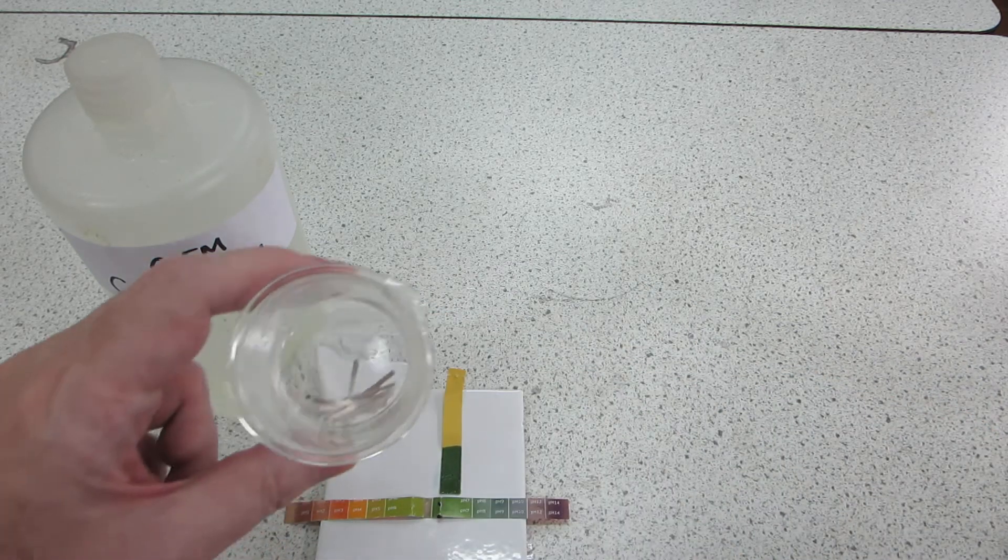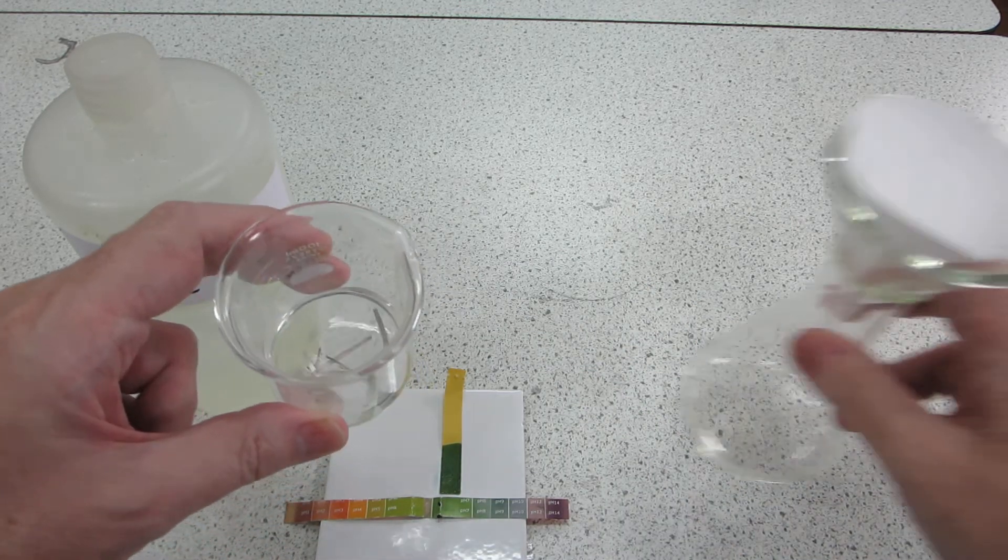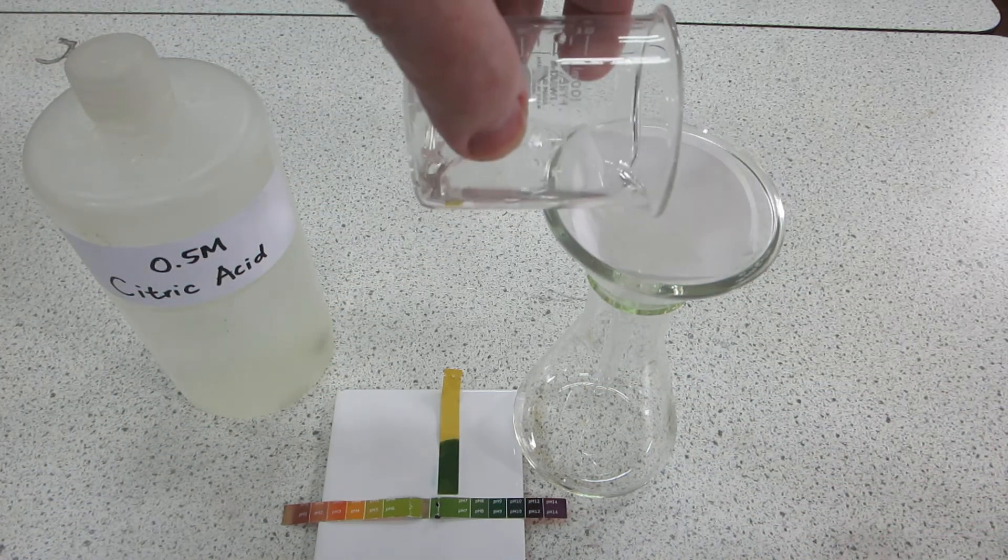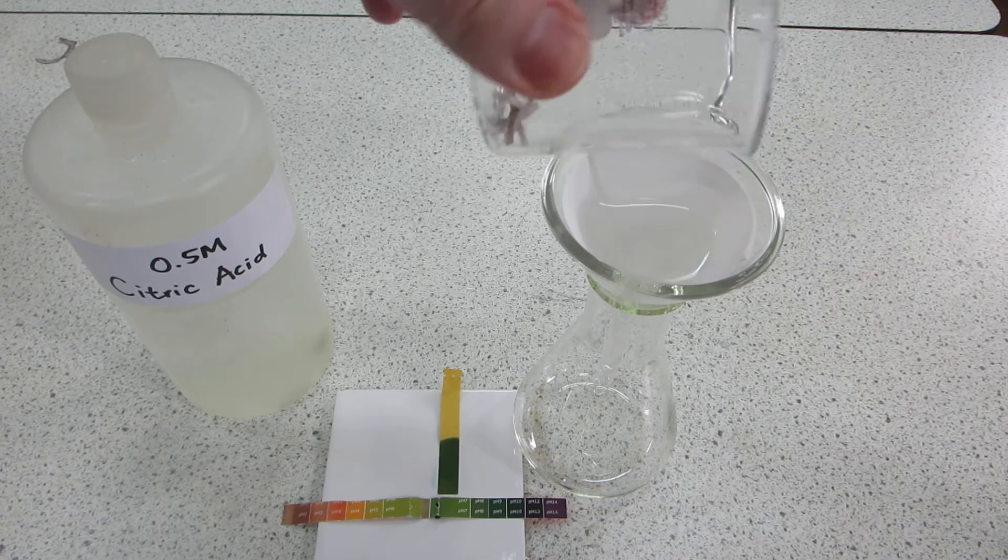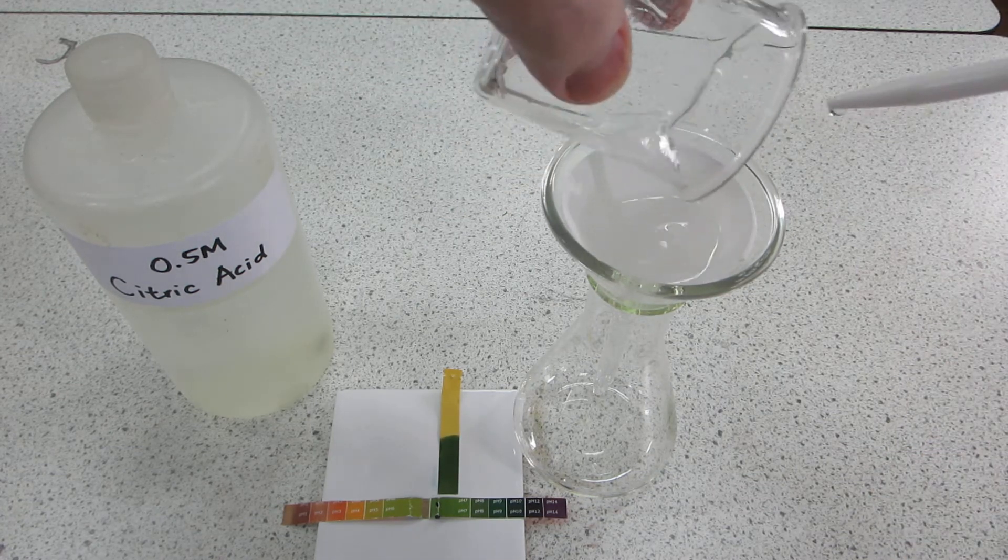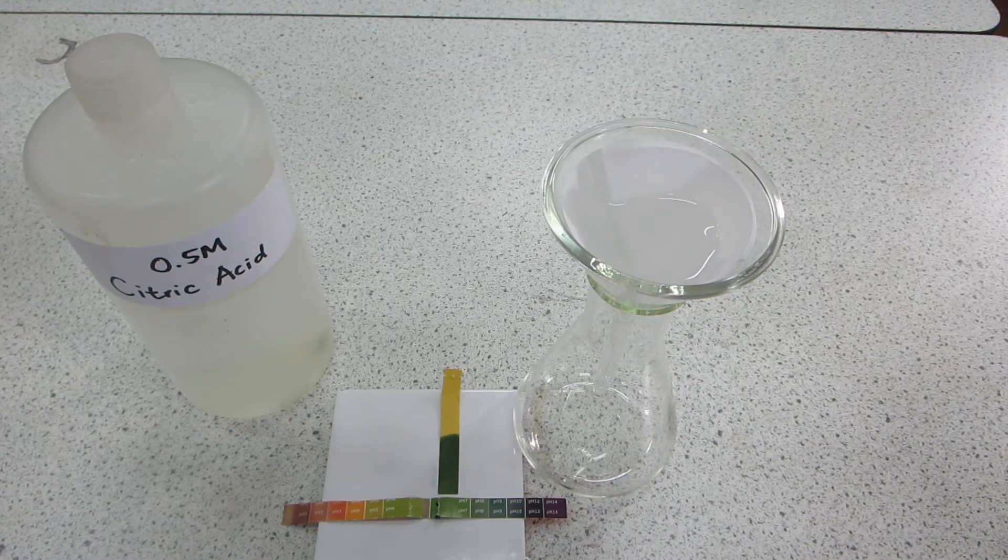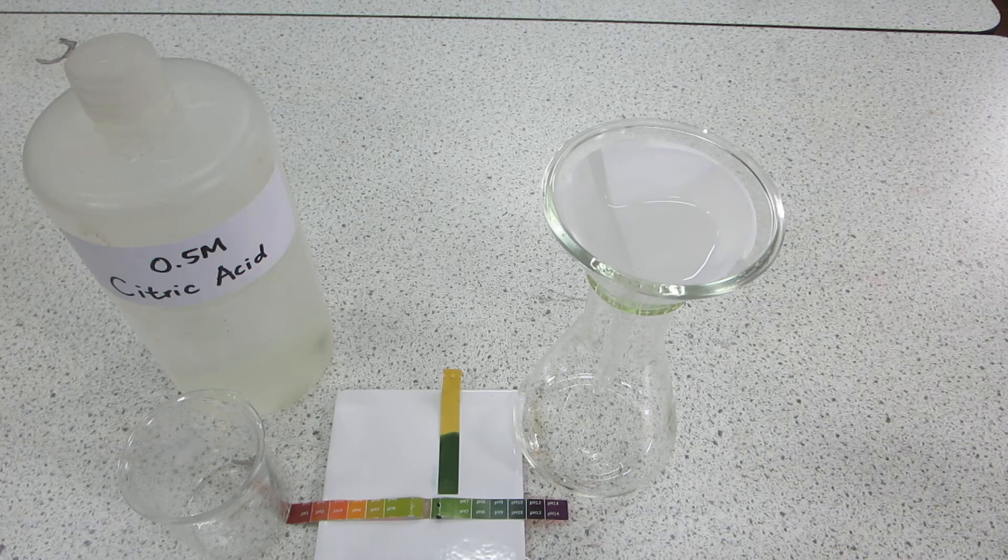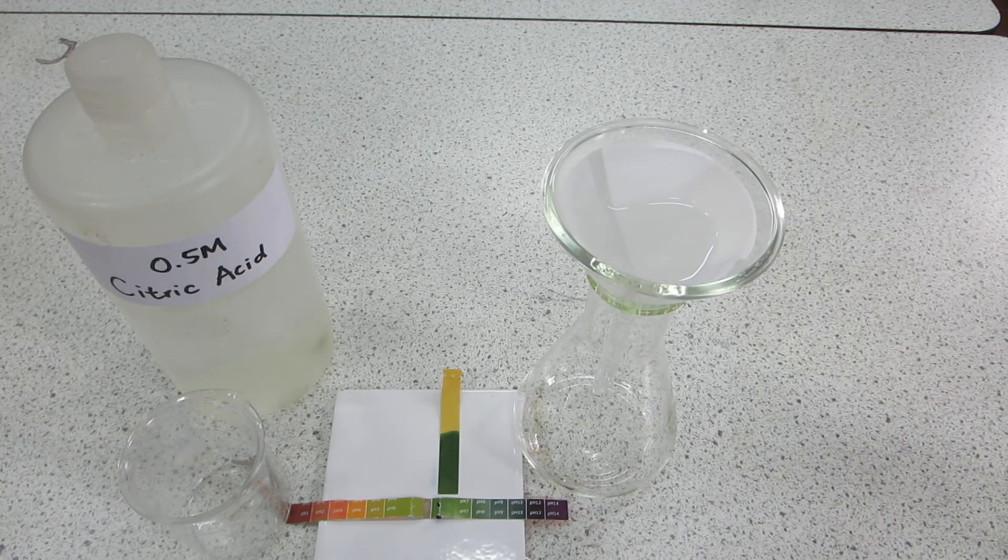Next thing to do is to filter off the magnesium to obtain the product in solution. Just rinse the magnesium lightly there. The filtration should be quite quick but we'll turn off the movie and come back in a few moments.